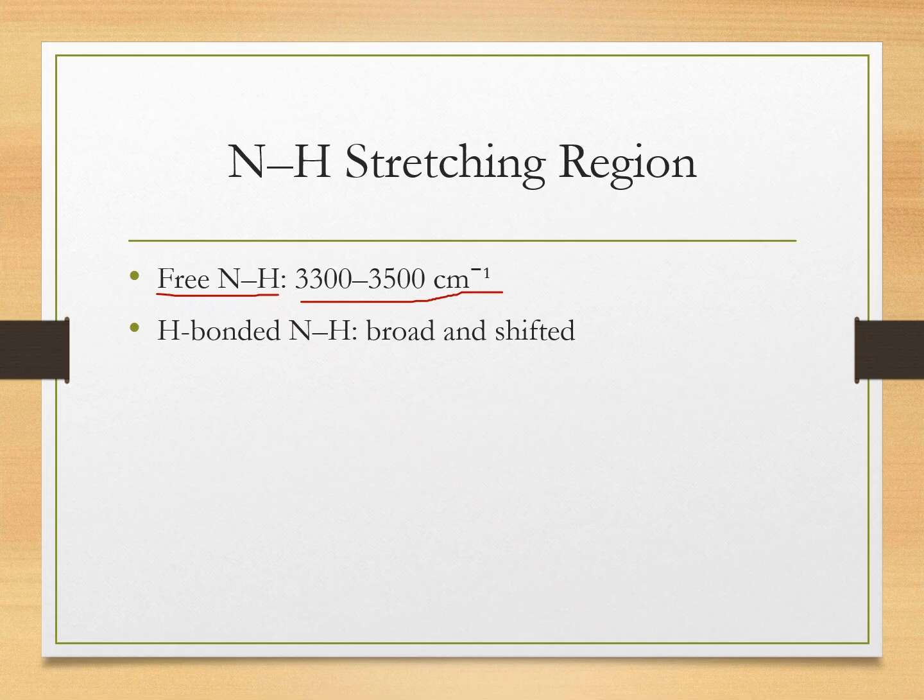And if hydrogen bonding occurs, the peaks broaden and shift to lower frequencies. In amides, hydrogen bonding becomes even stronger, creating very broad NH signals.